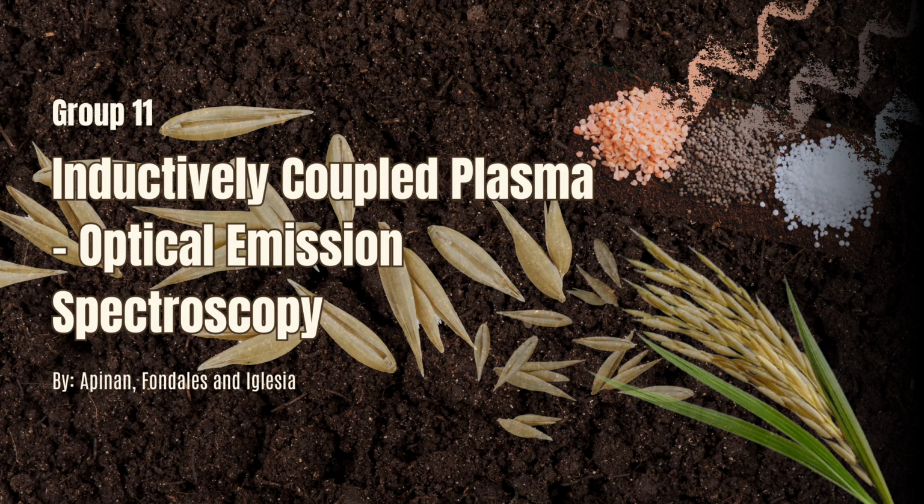We are Group 11 and we will be presenting ICP-OES, Inductively Coupled Plasma Optical Emission Spectroscopy. Our presentation will cover its underlying principles, key instrument components, advantages and limitations, and its application in a large horticultural soil experiment for NPK analysis. We hope you find our discussion informative and engaging.